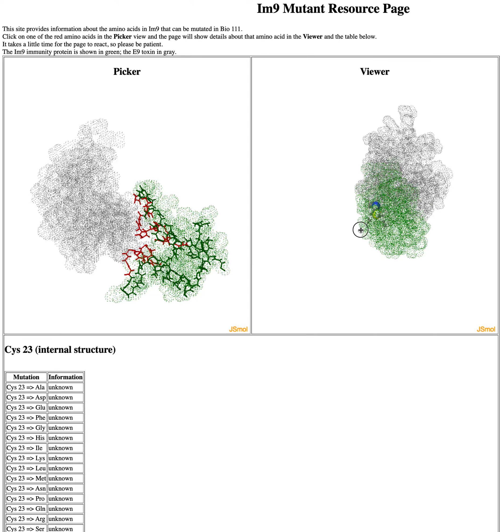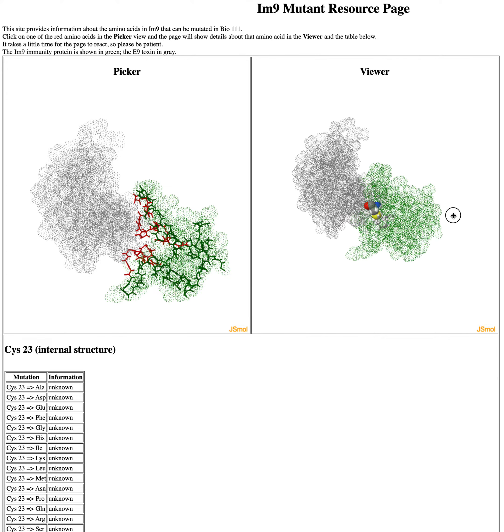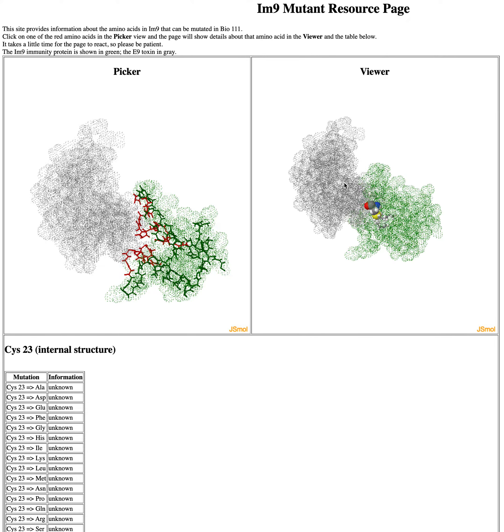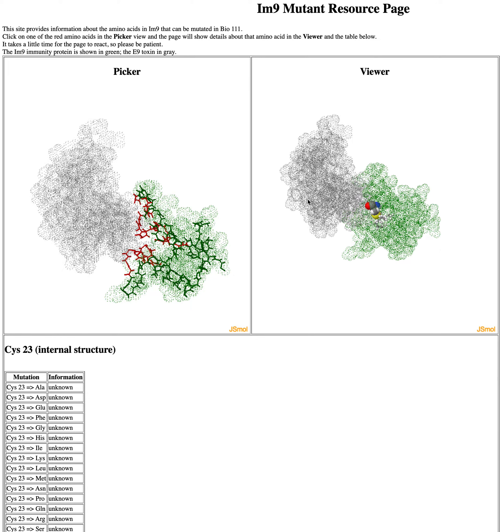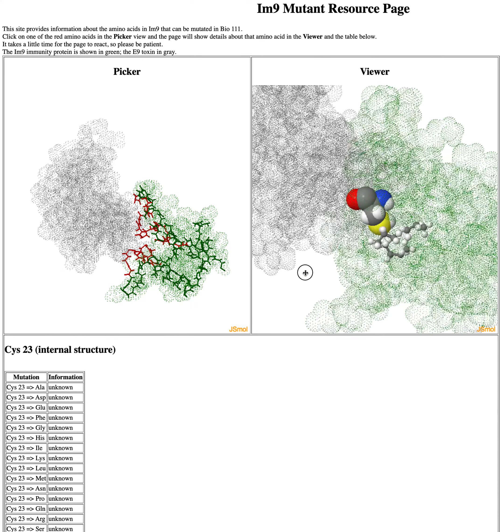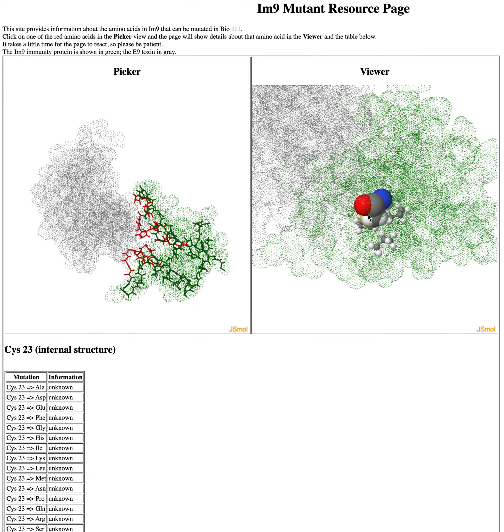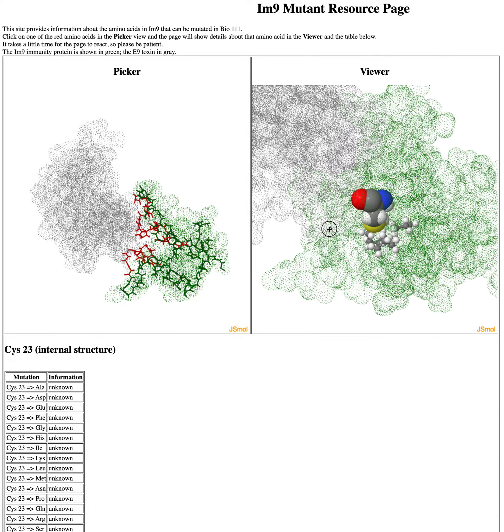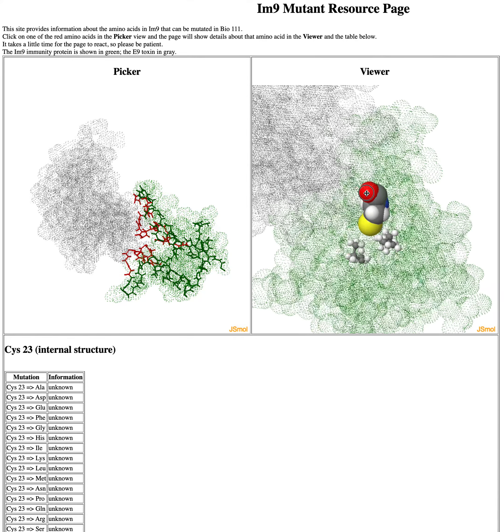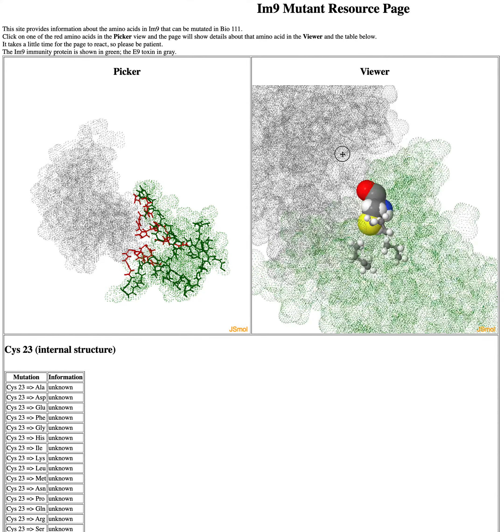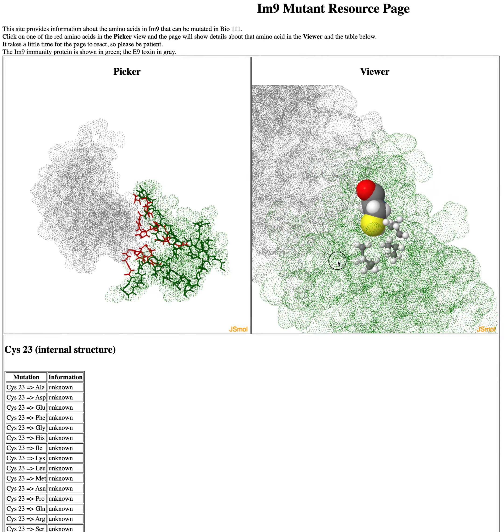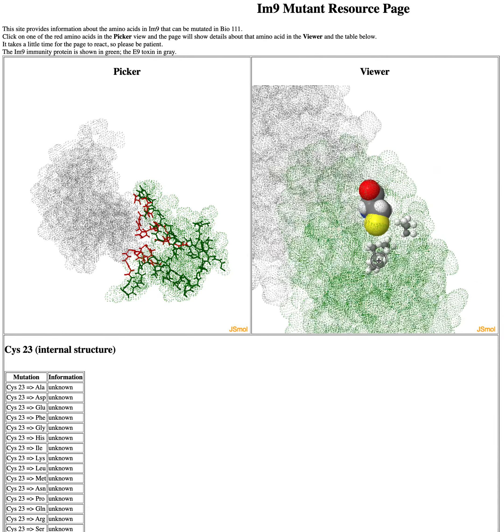If you want to get a better idea of what's going on with just cys23, you can see in the viewer page the toxin and the inhibitor — the IM9 protein we're mutating. Down here it says 'internal structure.' If you zoom in and roll around, you can see that the cysteine is mostly buried inside the IM9 protein, so it's not really touching the gray of the toxin. It's more about maintaining the internal structure of the IM9 protein.